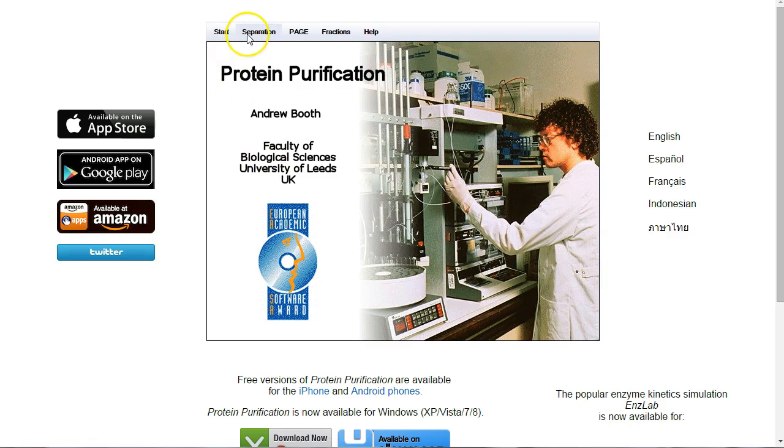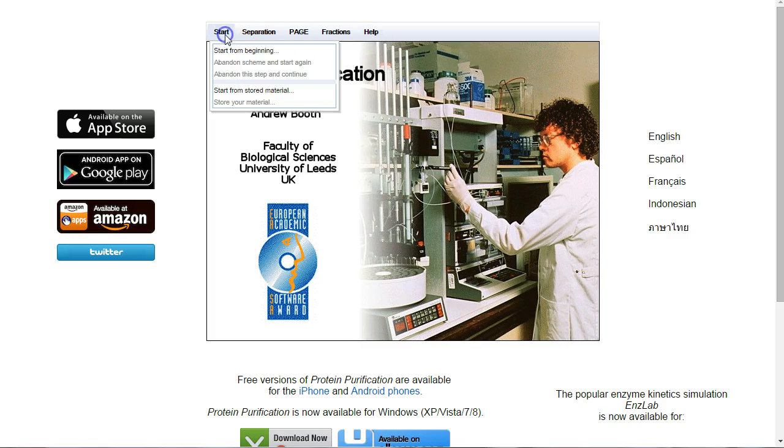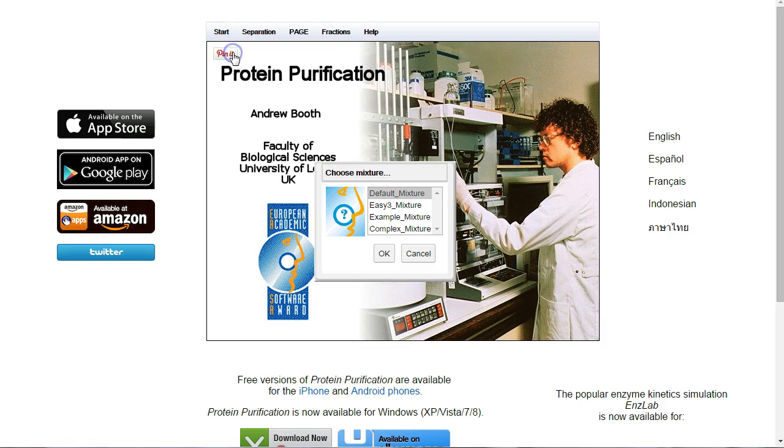Across the top, we've got a number of different tabs, and each one of these tabs allows us to access different parts of the program. First of all, we're going to go to Start, and we're going to start from the beginning.